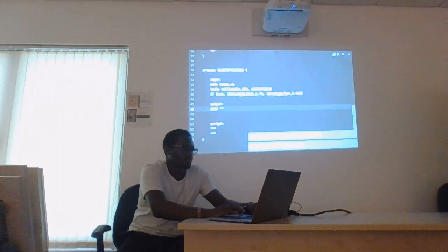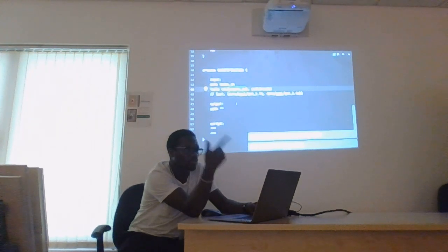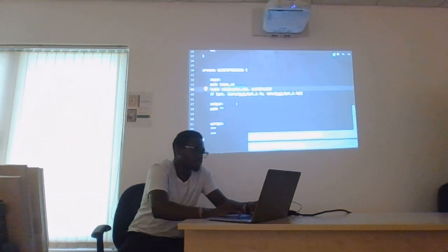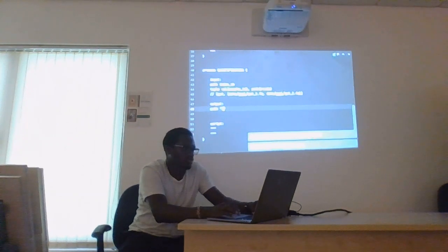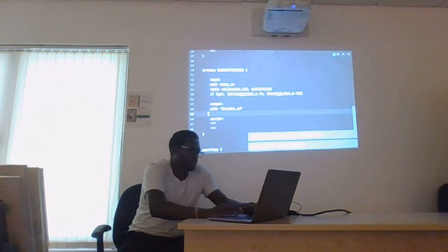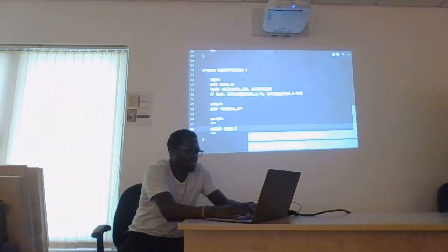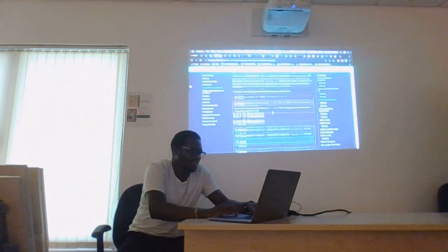So in here, because you already have this, for every sample we want to create an output directory. So we're going to use, I think, this should work out to denote every sample. And then the command should be salmon quant. Who knows how we run that command.